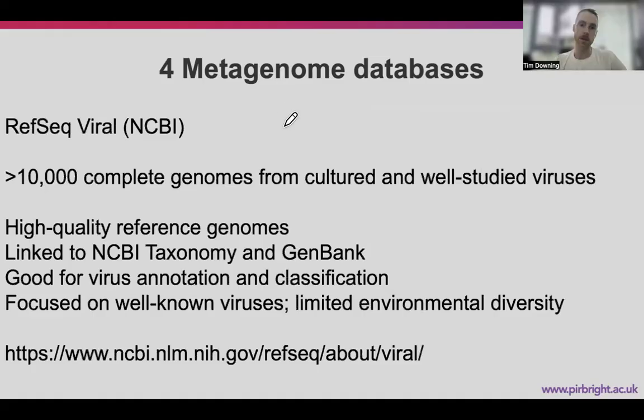Another one is the NCBI RefSeq viral database, which is 10,000 viral genomes from cultured and studied viruses. They're typically high quality ones, and this is good for viral annotation and classification, but it does have a limited environmental diversity.